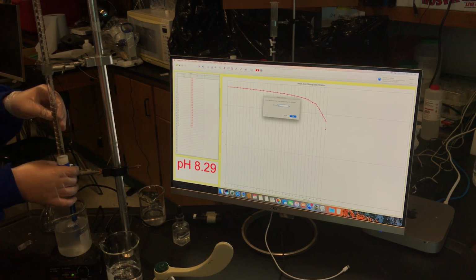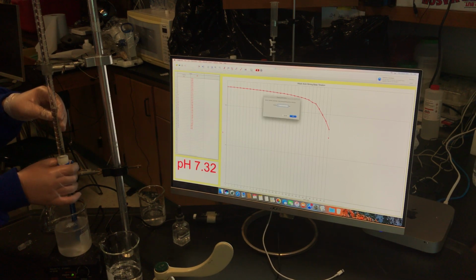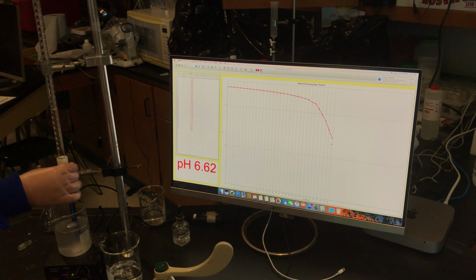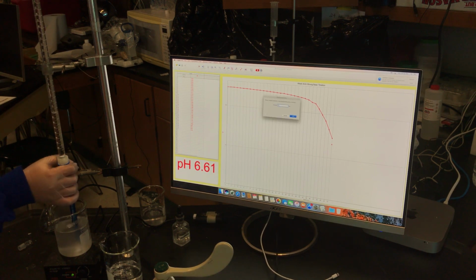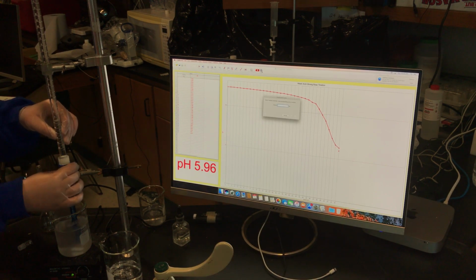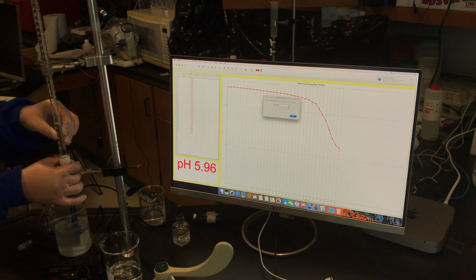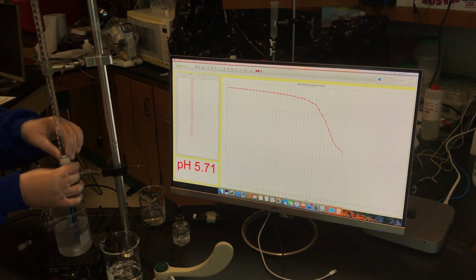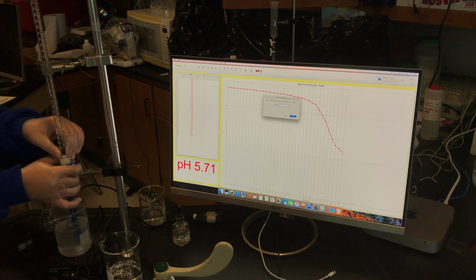Keep going till we level it out. All that work, guys, and look what this means. We're close to that 25 magic mark. Should be leveling out now. Good job. Keep going and level it out.